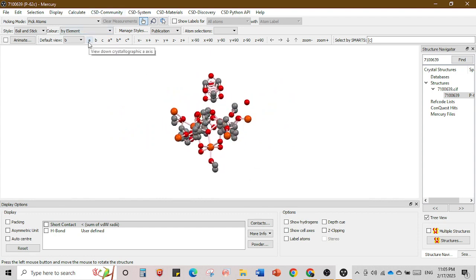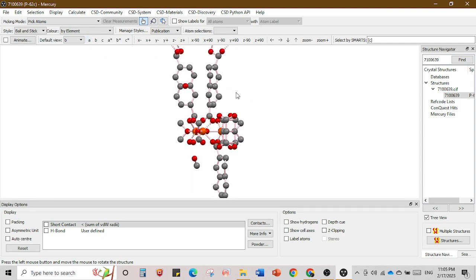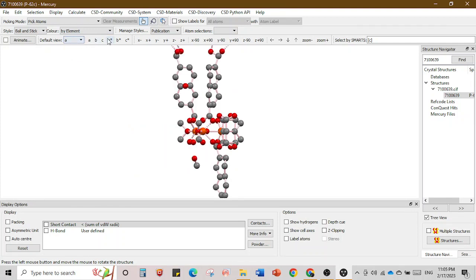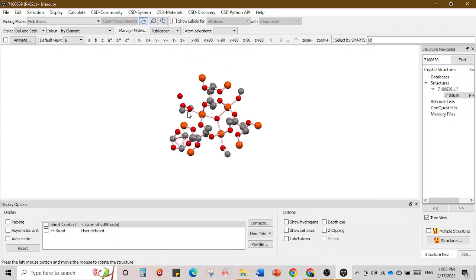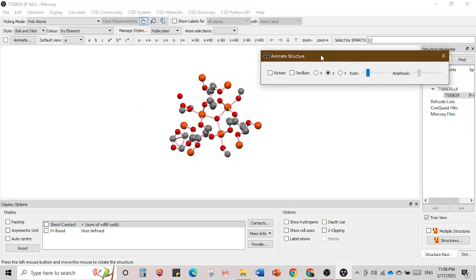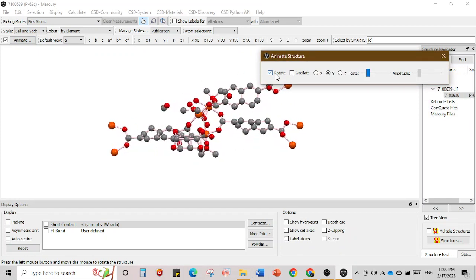We'll continue with this structure. When you click 'a' you are viewing the crystallography along the a-axis (x direction). Clicking 'b' gives the default direction, and clicking 'c' shows the actual pores — there are three accessible pores in MIL-88B, plus some solvent molecules. You can also animate the structure: click 'Rotation' and it will animate — you can record it as a video or save it as a zip file for your presentation.